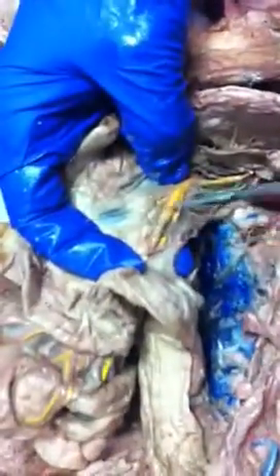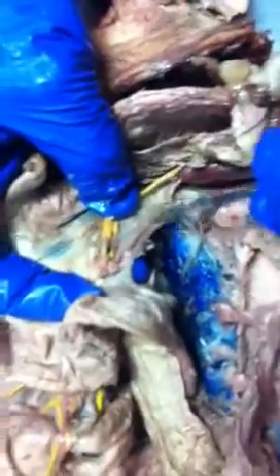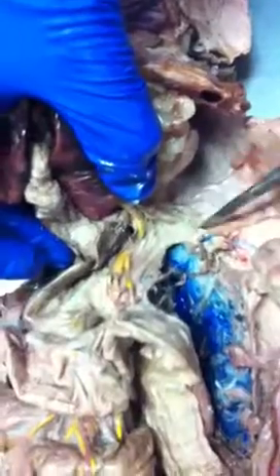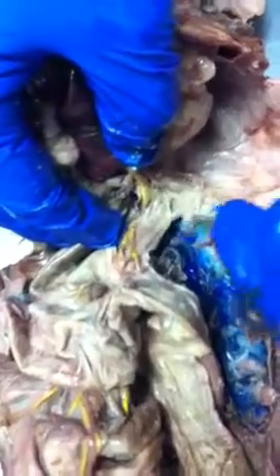Last, but certainly not least, branches off the dorsal aorta. Now, superior mesenteric vein, running with it, a nice superior mesenteric artery. Superior mesenteric artery is branch number 2 off the dorsal aorta, but we use it to find the first branch. What we're going to do is trace this down. Now again, because you did not clean up a lot of fat here, I cannot probably show you your dorsal aorta per se, but I can show you the 2 branches, which is better than nothing.